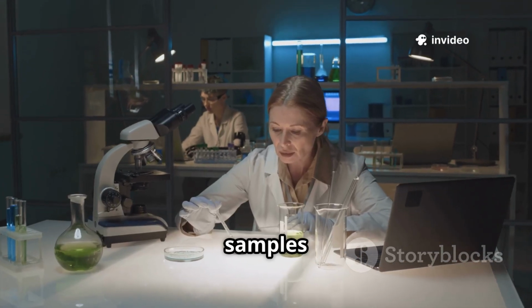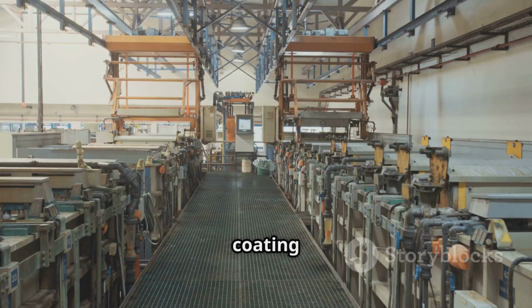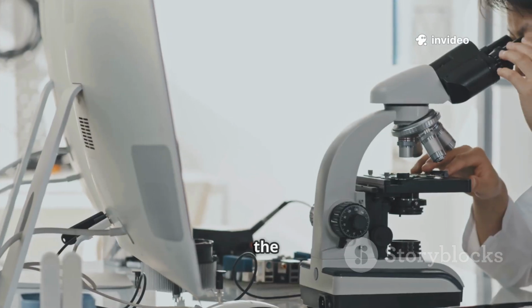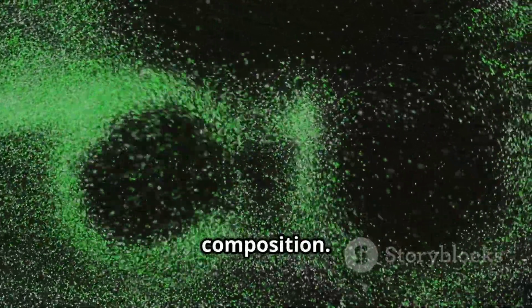Before imaging, samples must be conductive so electrons don't build up and blur the image. Non-conductive samples, like plastics or plants, get a thin metal coating just a few nanometers thick to prevent charging. Once inside the SEM, secondary electron images reveal surface shape, while backscattered images show material composition.